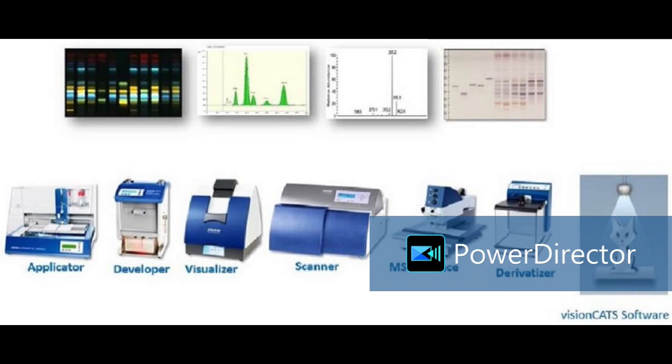Why I have asked this question: the department called Agmark, agriculture marketing. They use that marketing for export material. So they are also slowly merging into the other departments, like food and FDA. They want to transform the traditional way of adding chemicals, reagents, and biochemical tests. They want to switch over to technologies like this.